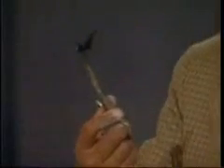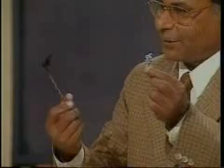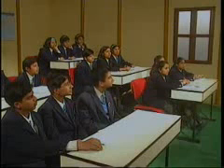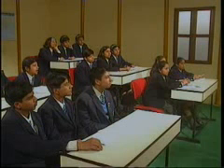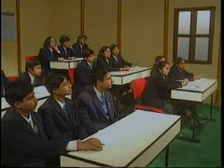See the color. Yes, this is silver. Great. Shiny. And this one is black. It's a dark brown, but it's looking like black. It is turning to brownish, and this one is only shiny. That means you find a change.